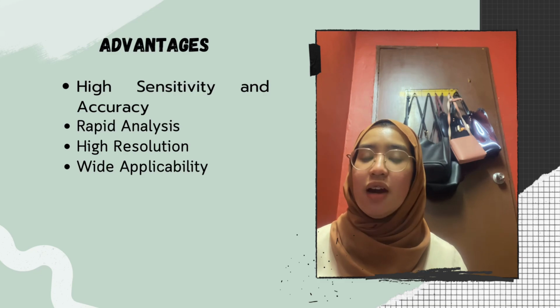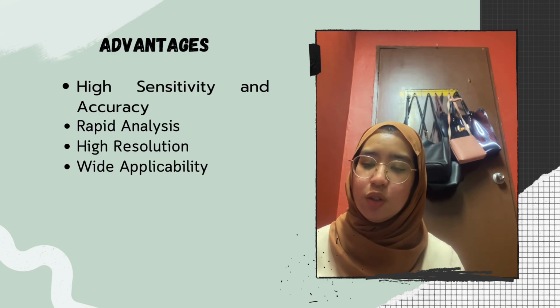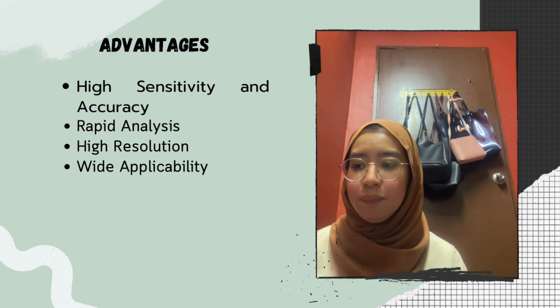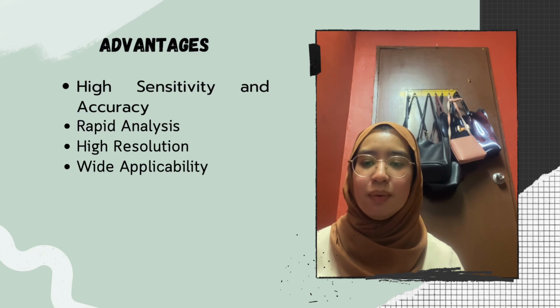Next, high resolution. GC separates complex mixtures into individual components with excellent resolution, enabling detailed analysis for multi-component samples. The last one, wide applicability. It is suitable for a broad range of volatile and semi-volatile compounds, including gases, liquids, and some thermally stable solids.